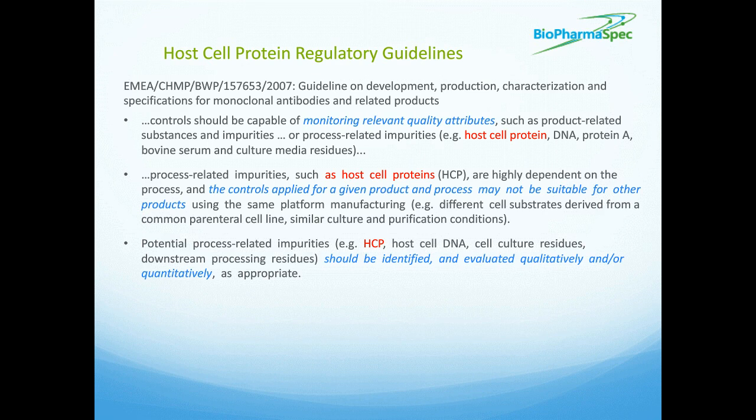So for the EMA, they discuss the monitoring of host cell proteins as a quality attribute that should be monitored with appropriate controls. And then they emphasize that controls that are appropriate for one product or process may not always be appropriate for the next product. So these controls really need to be product specific and looked at pretty frequently.